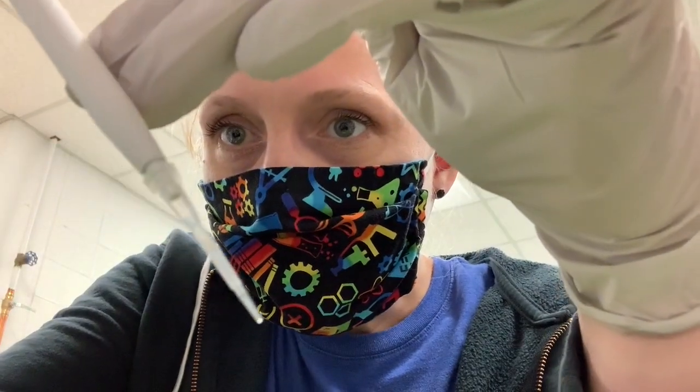Be careful when you're pipetting 1 microliter, it's not very much, so just make sure you really are paying attention to how much volume is coming up into your tip. Let's see if you can see it there.